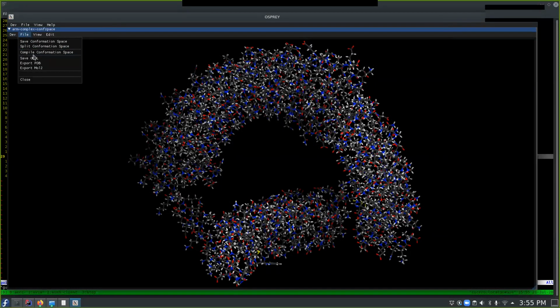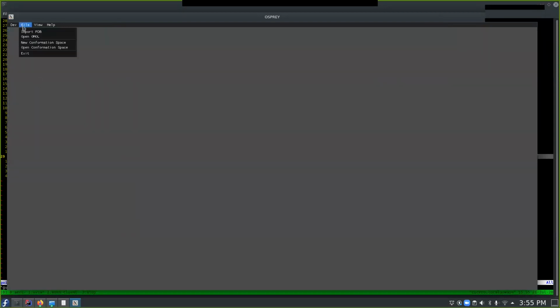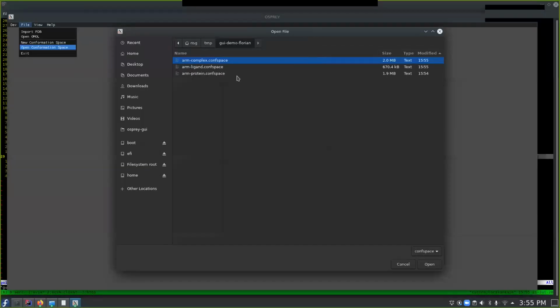So I'm now going to close this and open the conformation space for the ligand. We'll start there.